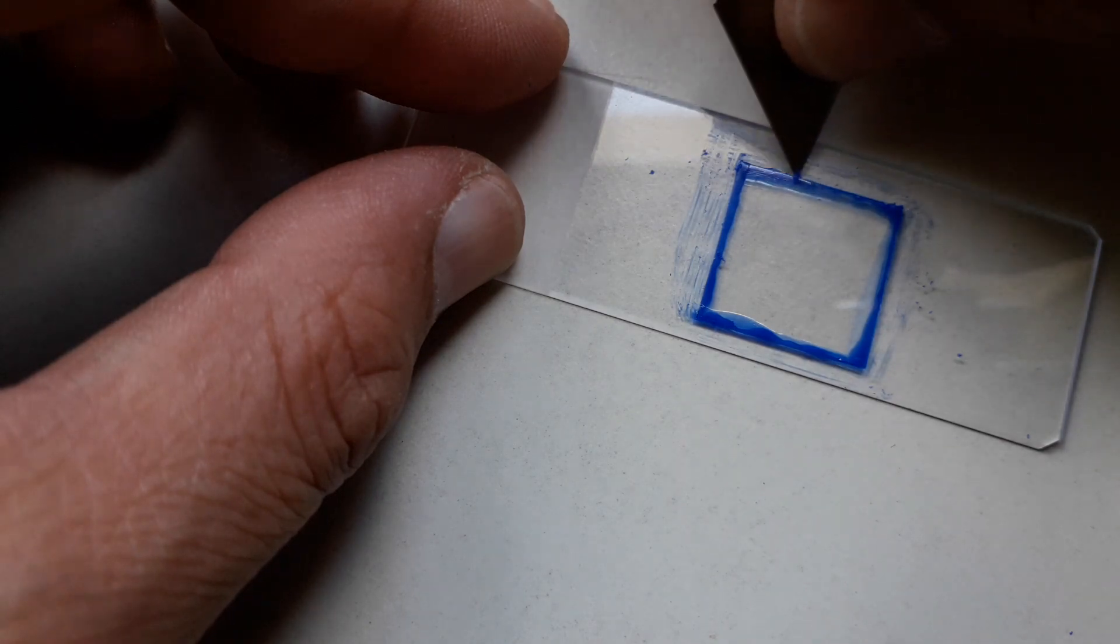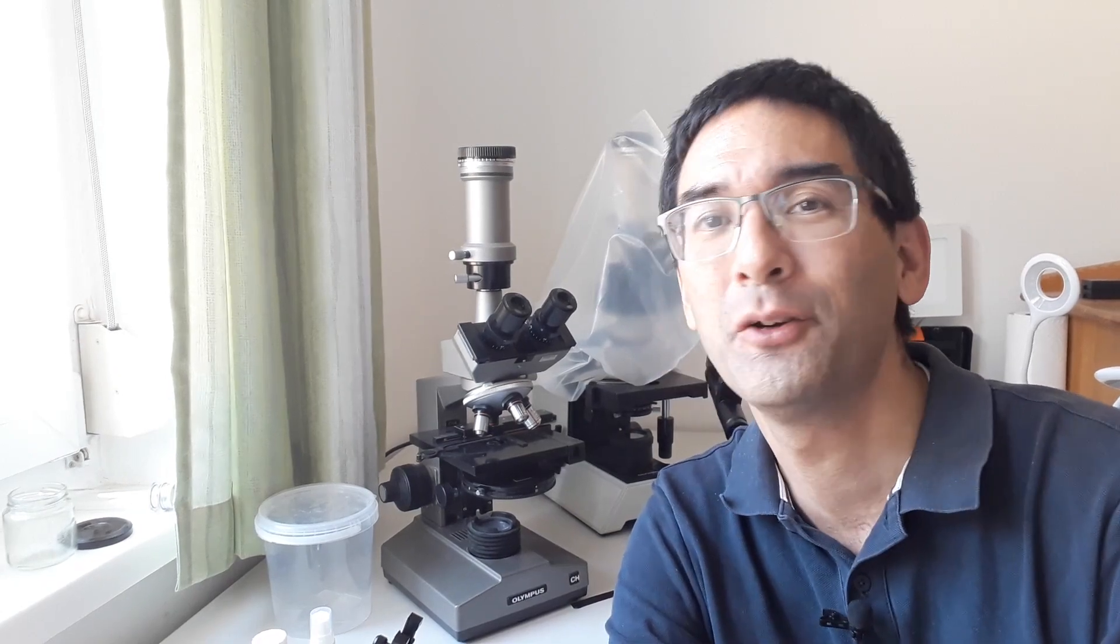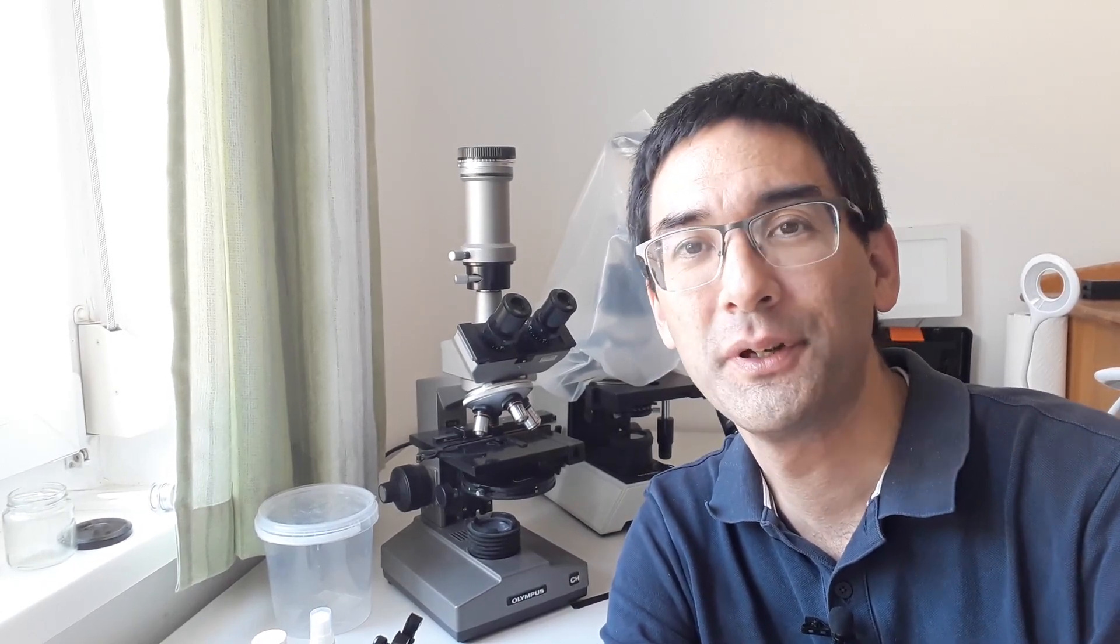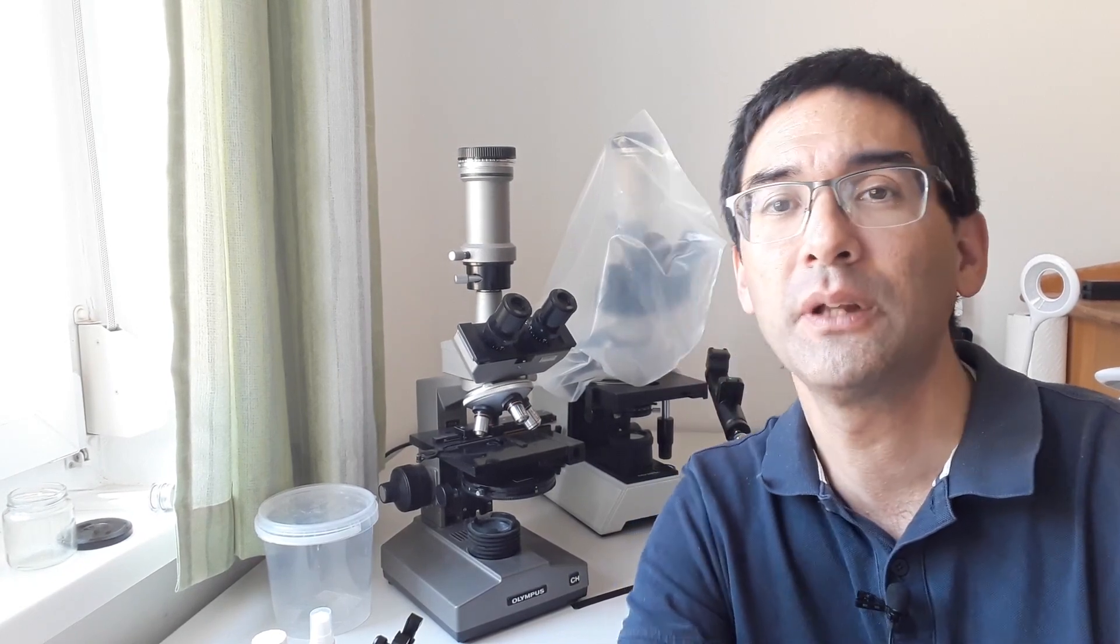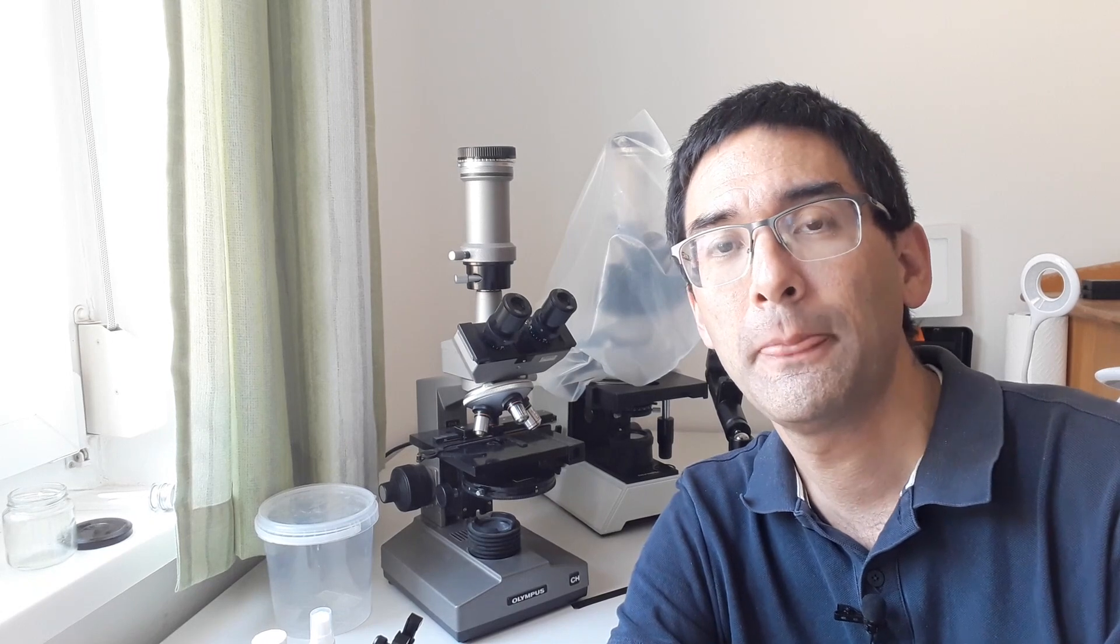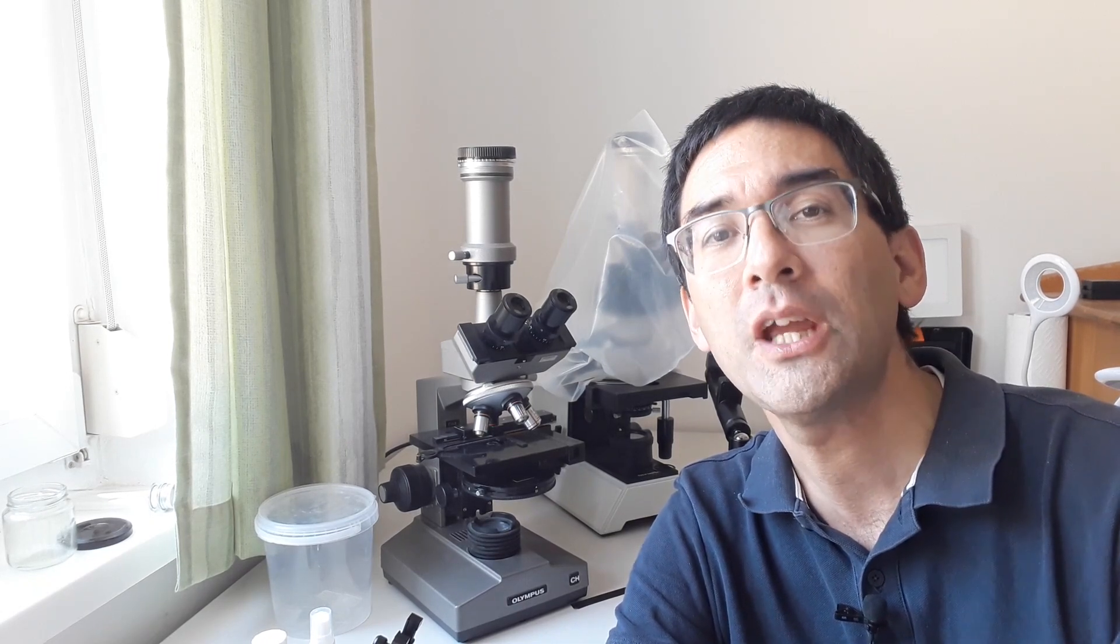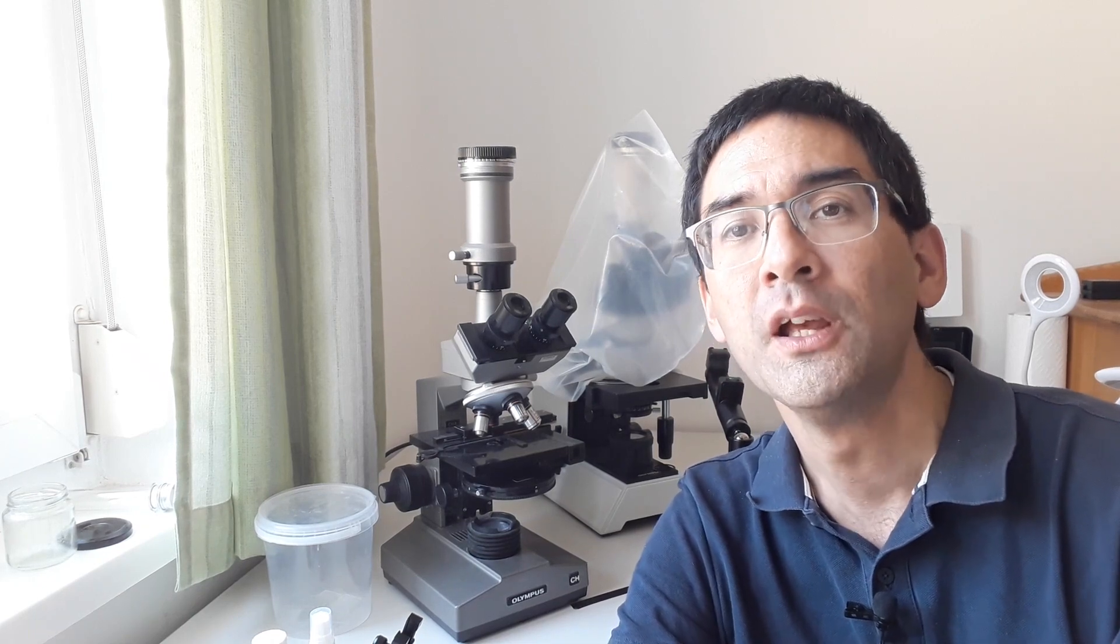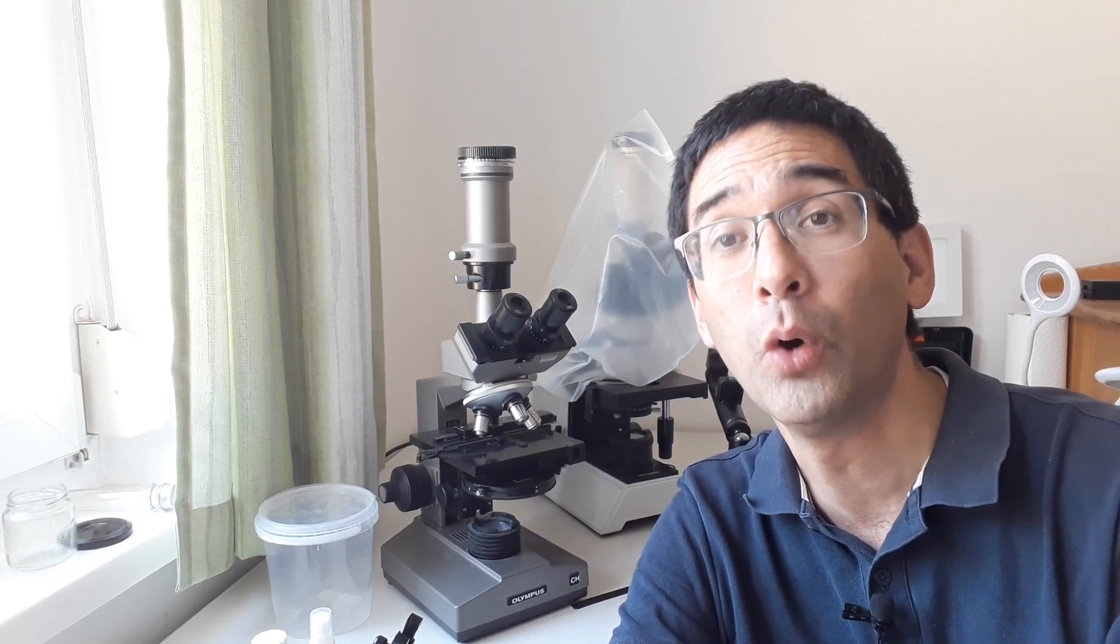Which specimens work well? Anything that is flat and thin and dry of course. For example, insect wings work very well. Dust specimens, collected dust, pollen also. Fur and hair of animals, that's a possibility. Generally I would recommend anything that does not change its shape and structure too much when it's dry.